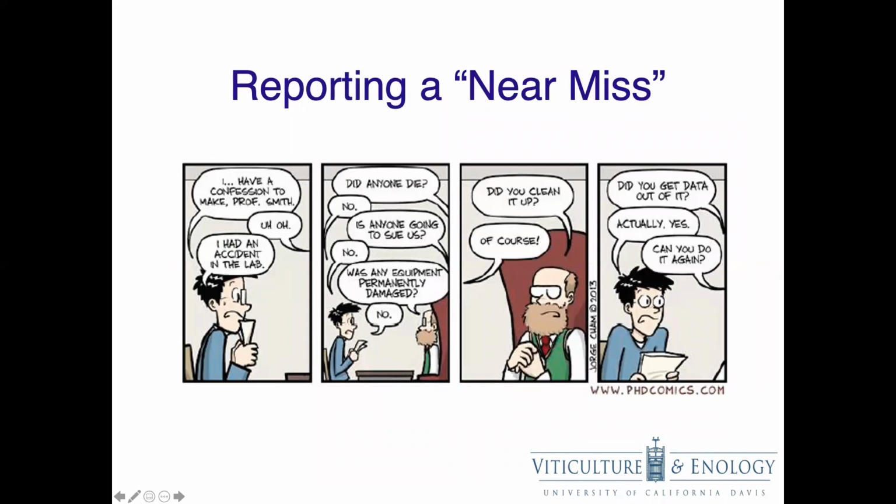So we talked about laboratory accidents, but what about near misses? These are important as well as they can help prevent an accident from happening in the future.